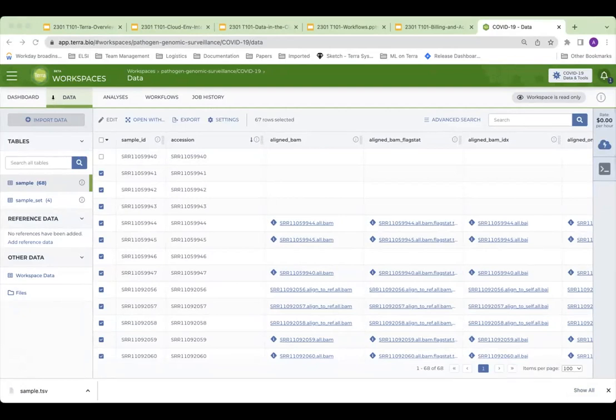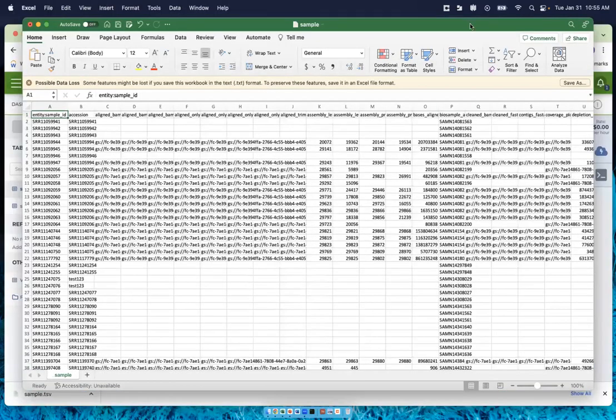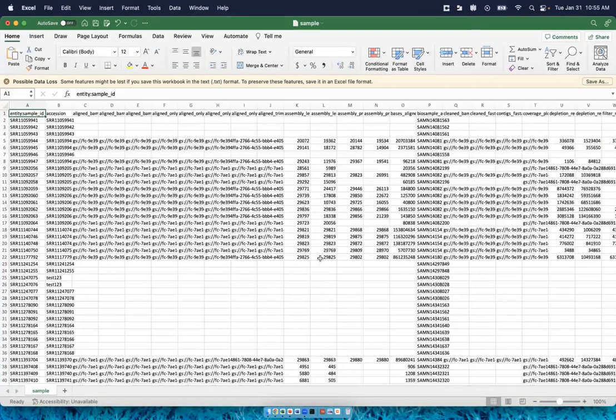The one thing that I want to draw everyone's attention to, that's fairly important if you end up playing around with tables like this, is this top left cell has to be... Anton, I think we only see your Chrome window. Oh, this is my Chrome window. I'm so sorry. One moment. Let me fix that. So here, everyone can see my Excel sheet. Yep. Wonderful. Thank you.